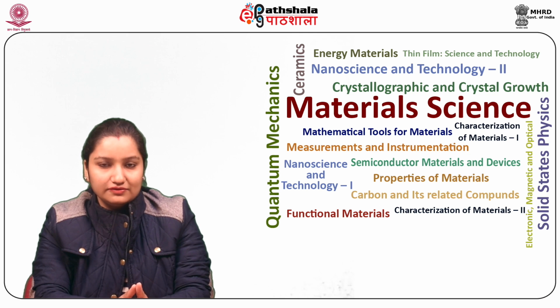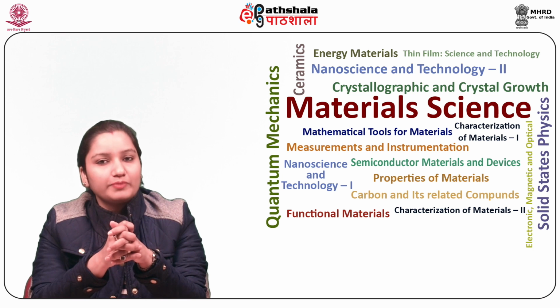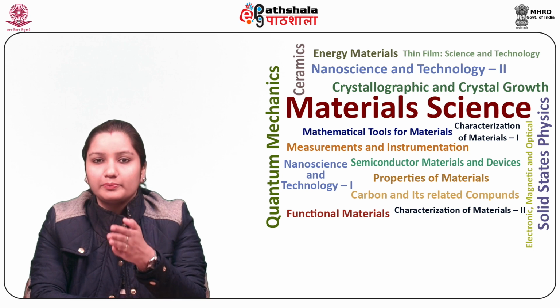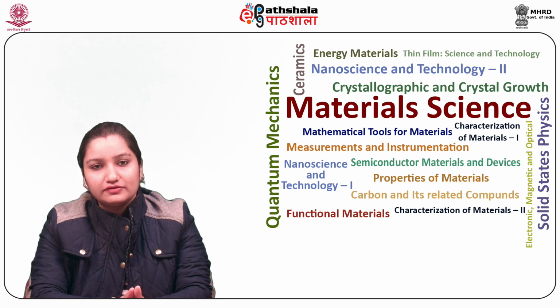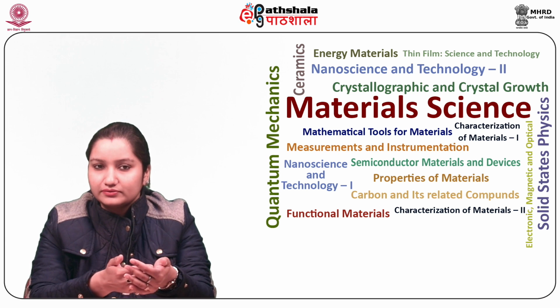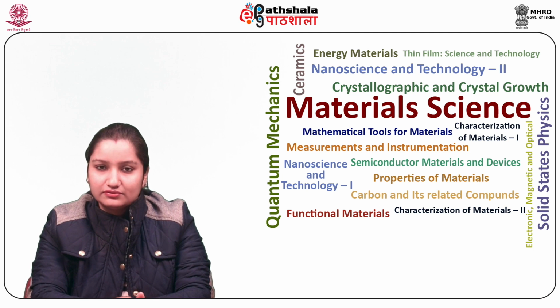So before getting into the details, let's have a brief introduction about the principle of the FTIR. Infrared or IR spectroscopy is an important system in organic chemistry which can identify particular functional groups present in the molecule. Additionally, the unique group of absorption bands can readily ascertain the characteristics of pure compounds and also locate specific impurities. Infrared spectroscopy works on the principle that the molecules vibrate at specific frequencies.